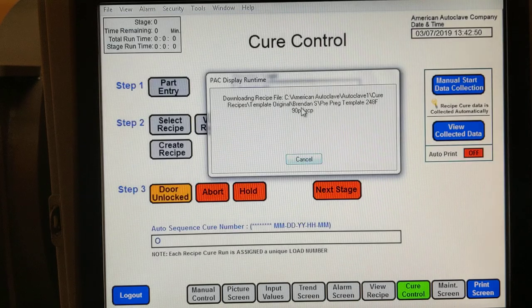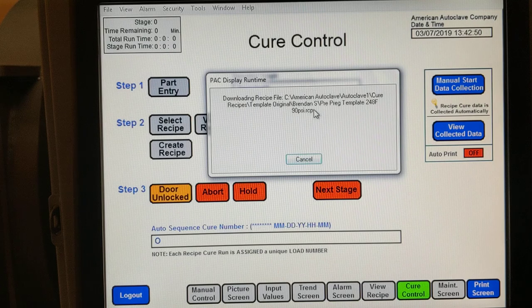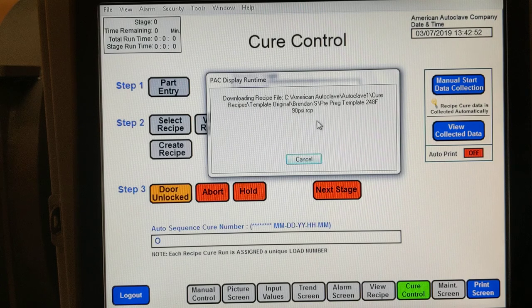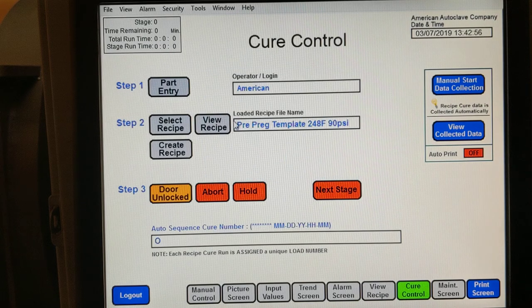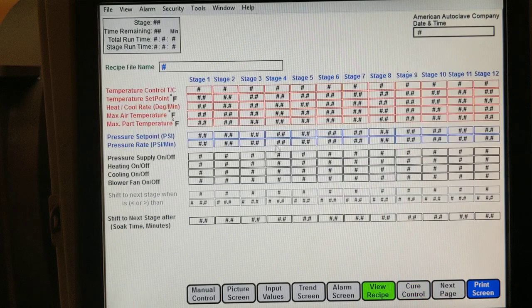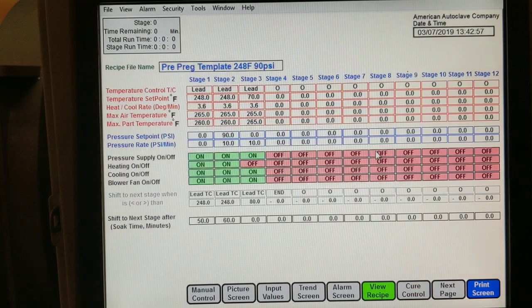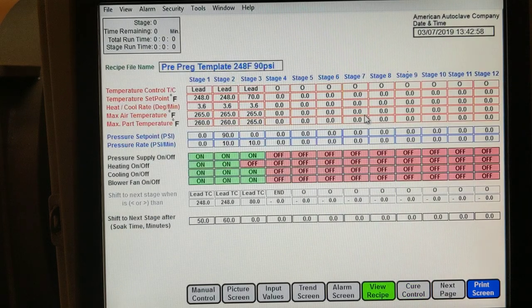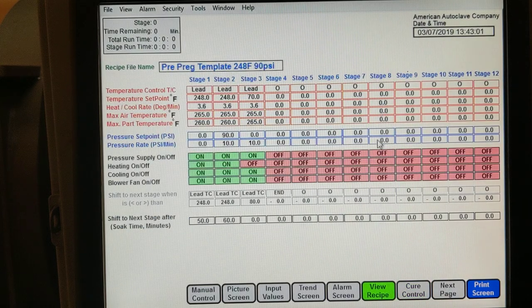Do open, and then you can view the recipe and do whatever you want to do with that recipe.